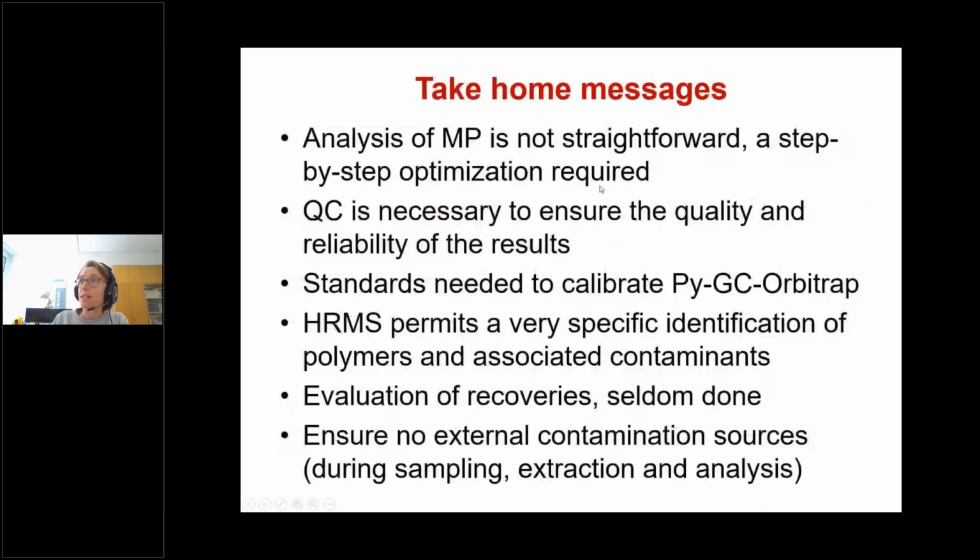So the take-home messages are that the analysis of microplastics is not straightforward and a step-by-step optimization is required, that quality control analysis is needed to ensure the reliability of the results, that the standards are needed, that the high-resolution MS permits a very specific identification of the polymers and also, by doing non-target analysis, of the associated contaminants. It is important to calculate the recoveries now that there are standards, which in many papers is not done, and also that the external contamination should be checked to avoid false positives.